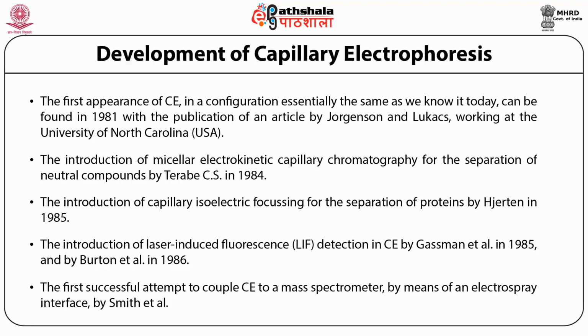Gels in slab or tube format have been used primarily for the size-dependent separation of biological macromolecules such as nucleic acids and proteins. Although it is one of the most widely used separation techniques, slab gel electrophoresis generally suffers from long analysis time, low efficiencies, and difficulties in detection and automation.